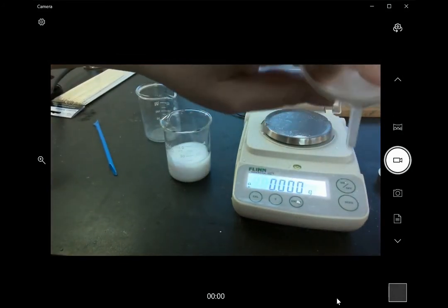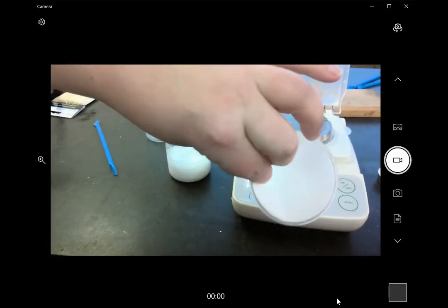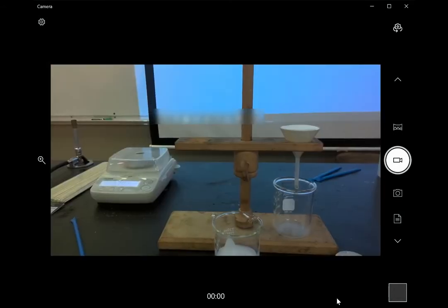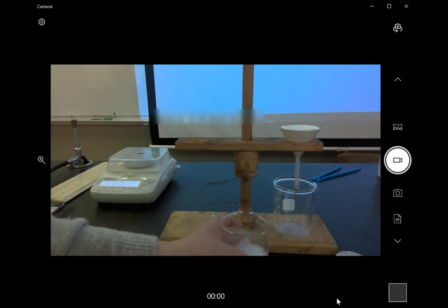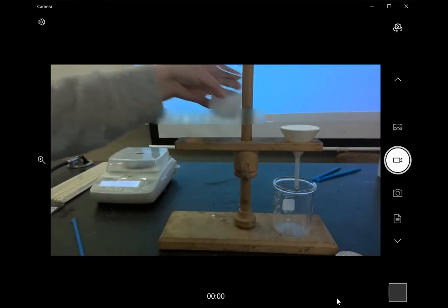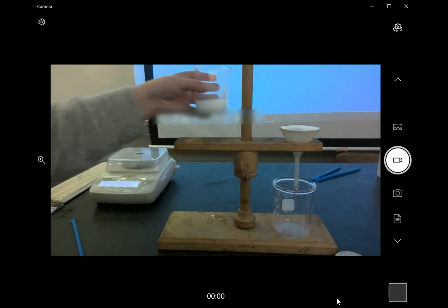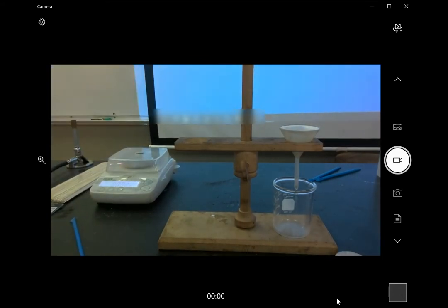And if it doesn't stay you may want to just add a little bit of water, distilled water of course. So now I just need to filter that product out. And it takes a little while, you're going to have to let it drip for a while and then add more because we don't want to overfill our funnel.